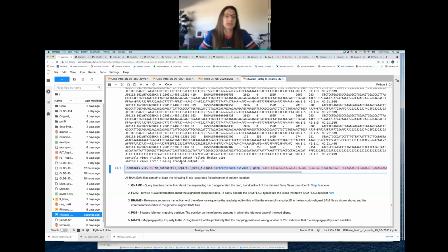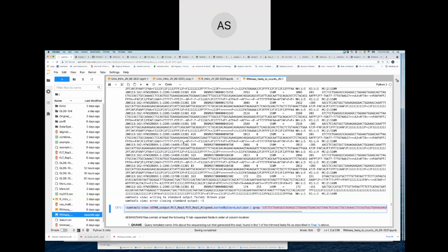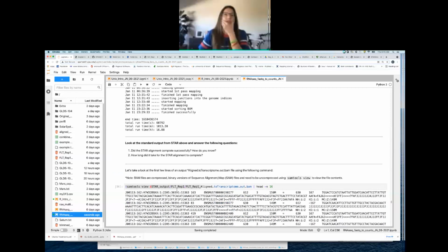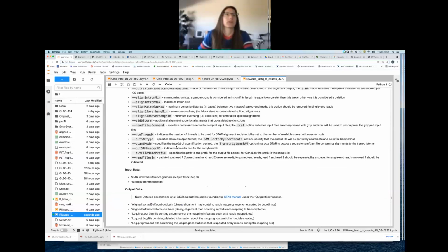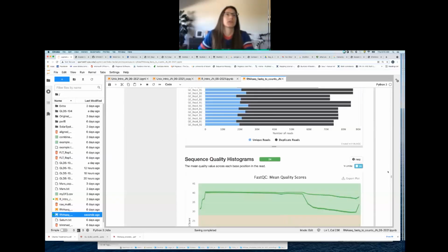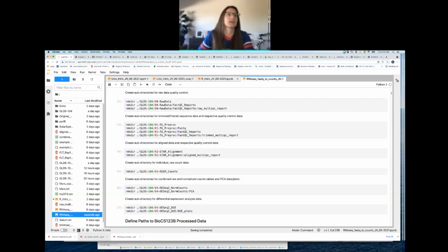That's a little mysterious to me too. Right? That's frustrating. Try again. More time. I mean, I guess we could try again. I'm gonna go to the command line and see if I can't get it from there. I just want to get the path to. I guess I could have echoed it.